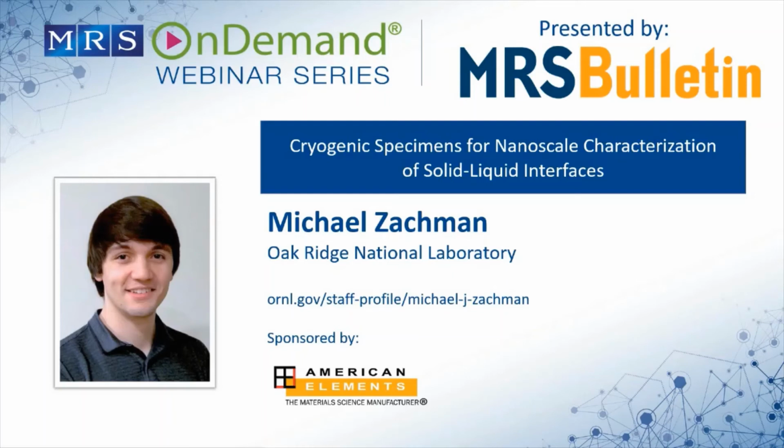Yeah, and I mean, it's also interesting, with the imaging capabilities in the FIB these days, the ability to do STEM imaging in a FIB. There'll be some cases here where it's almost better to do the entire experiment inside the FIB rather than even taking it to the TEM. Yeah, absolutely. It just depends on how small you need to see and if you need bonding information, because you can get some elemental information at a pretty decent resolution from within the FIB.